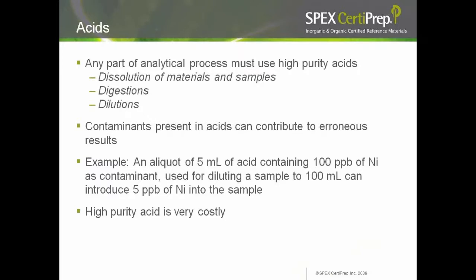Acid plays a major role in sample analysis — for dissolution of materials, digestions, and dilutions. Contaminants present in acids can contribute to erroneous results, so any part of the analytical process must use high-purity acid. For example, if you use 5 ml of an acid with 100 ppb nickel diluted to 100 ml volume, it can introduce 5 ppb of nickel into the sample. Hence, you need a very high-pure acid, but very high-pure acids are ten times more expensive than technical grade acids.